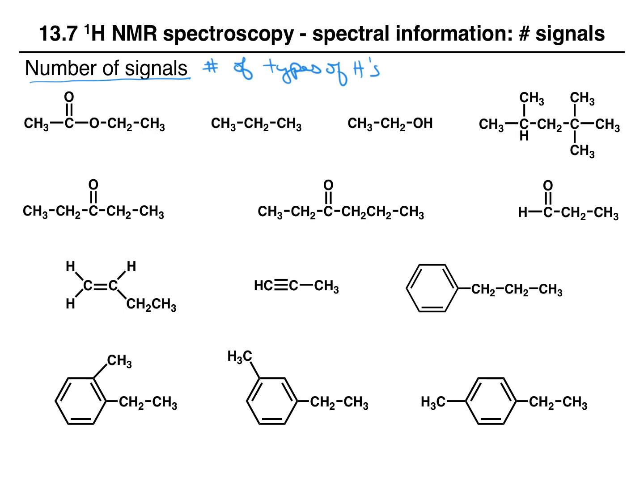If we think about a CH3 group, for example, here's a carbon, it's connected to another carbon. This carbon is tetrahedral, so this is what our hydrogens are going to look like. Here's our shape. If we were to take a snapshot, then this hydrogen is in a different environment than this one or this one.